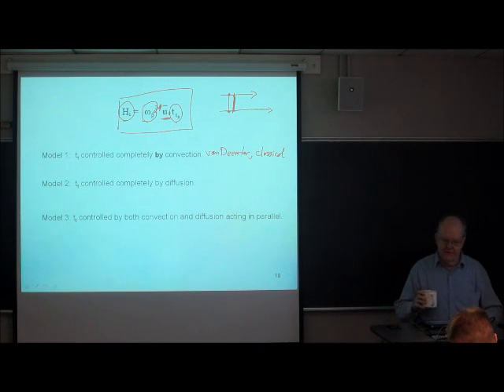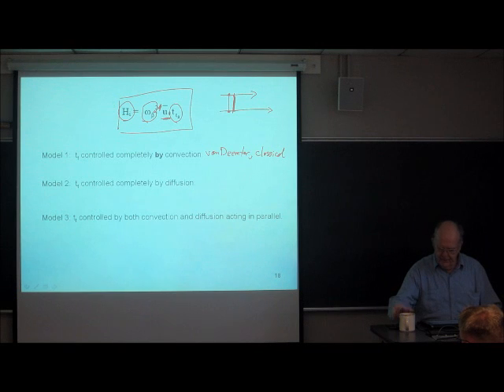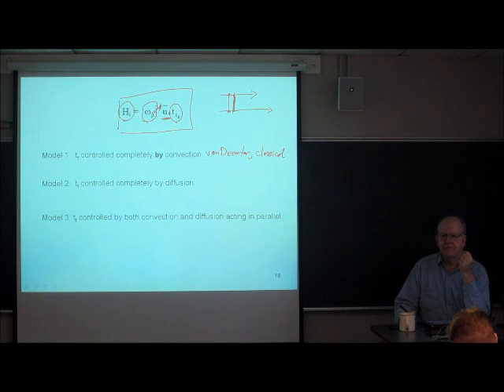Within about 3 or 4 years, other people said, at low velocity, that doesn't make sense, because at low velocity, diffusion is going to dominate the transfer process.